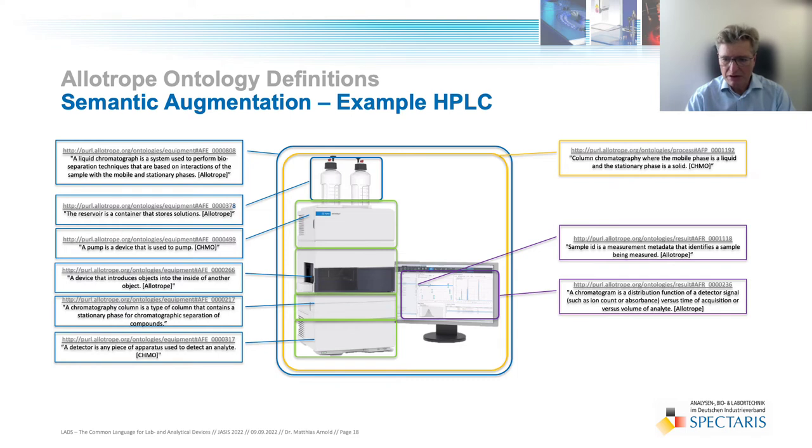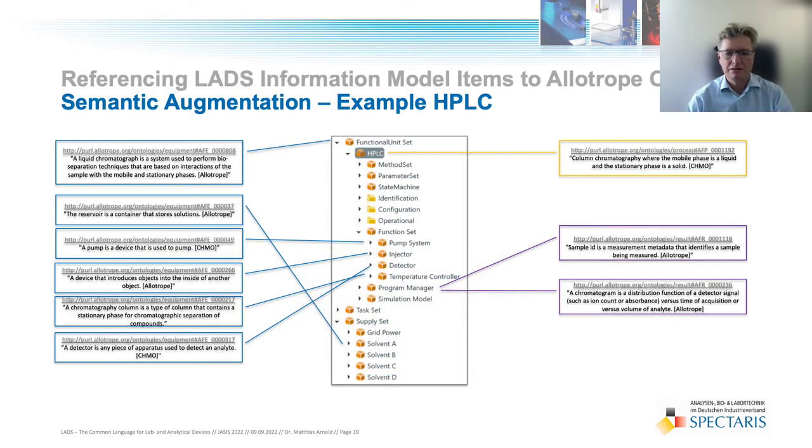In the LADS OPC UA information model of the instrument. Here comes the solution. The HPLC's different components and items that we just discussed have their corresponding representation in the LADS OPC UA information model of the device.